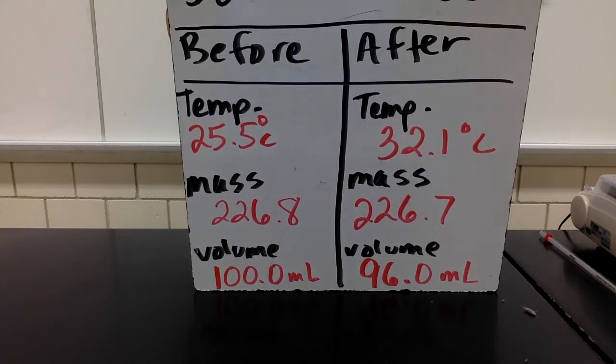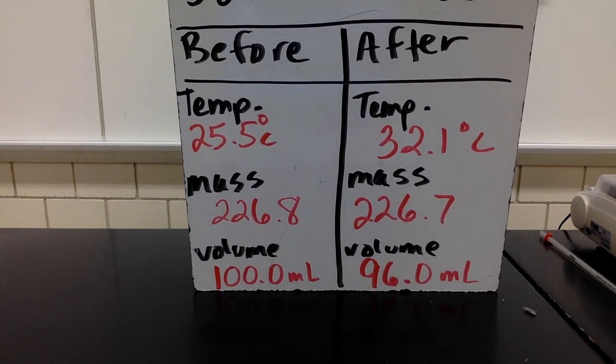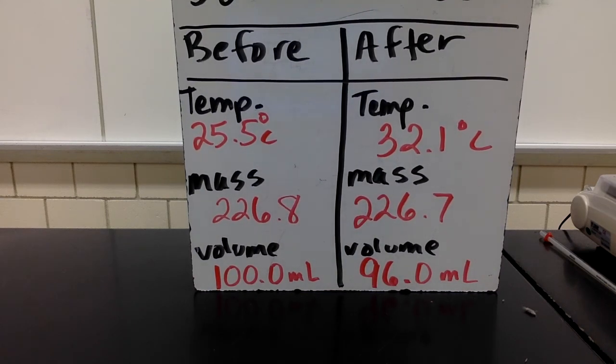So there is the before and after data, and I'm curious to see what you have to say about why we saw this dramatic decrease in volume when we mix the two liquids together.